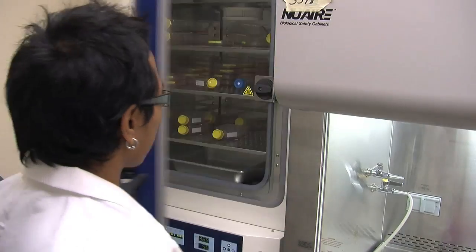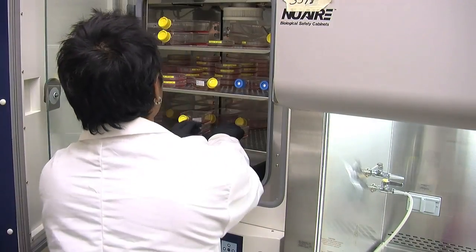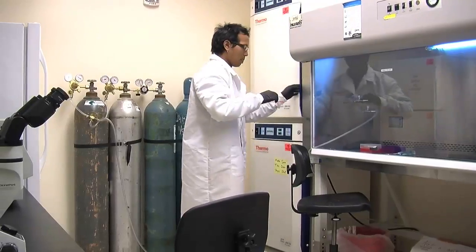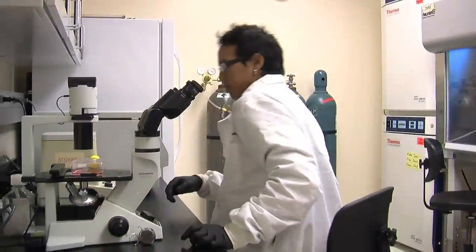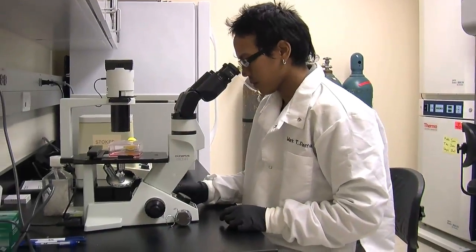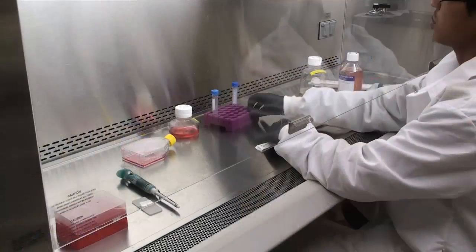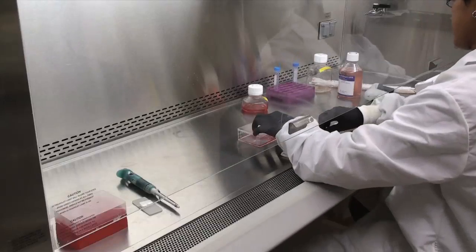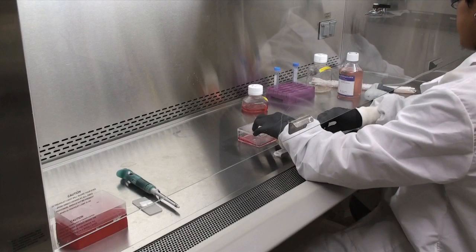Next, take out your culture flask and screw the cap tight while transporting it over to the microscope. Make sure the flask is kept horizontal. Look at the cells through the microscope to gauge the density of the cell population. Transfer the flask to the center of the culture hood and move instruments and media to the lateral ends, allowing for unobstructed laminar flow.